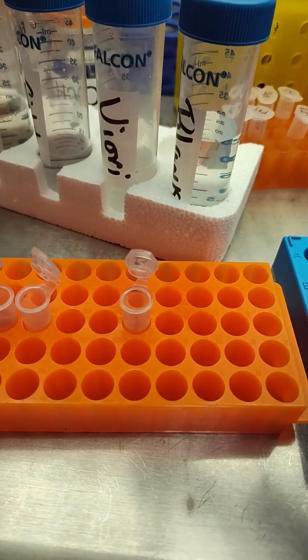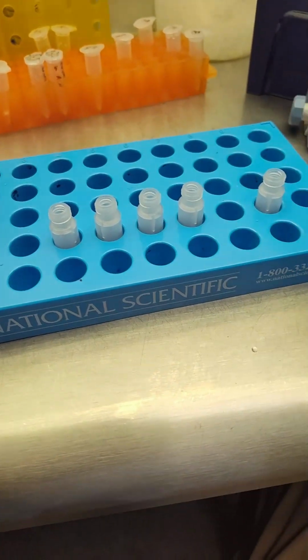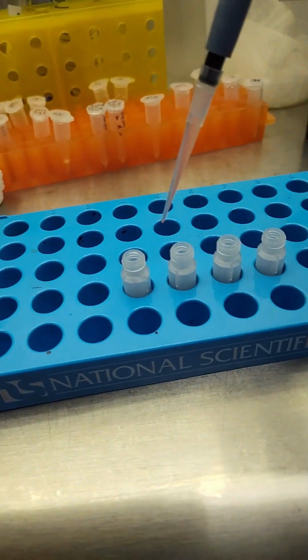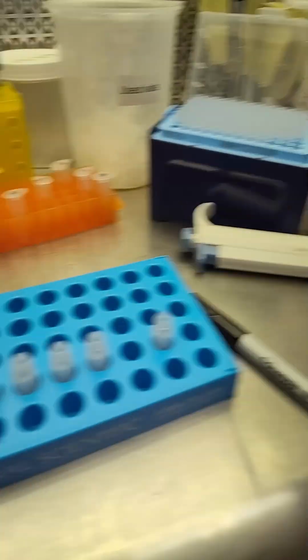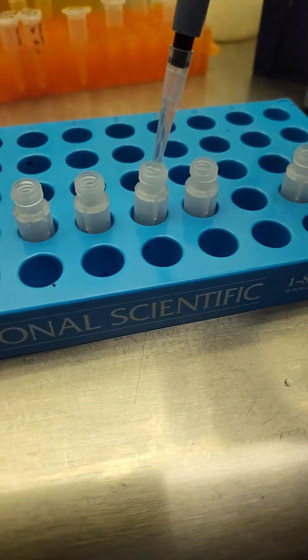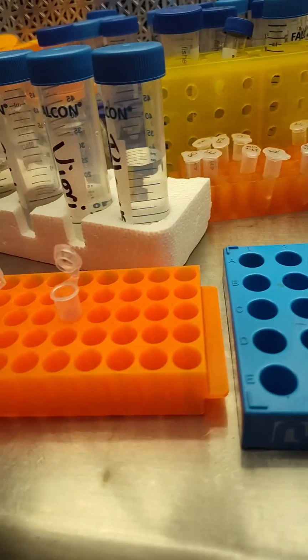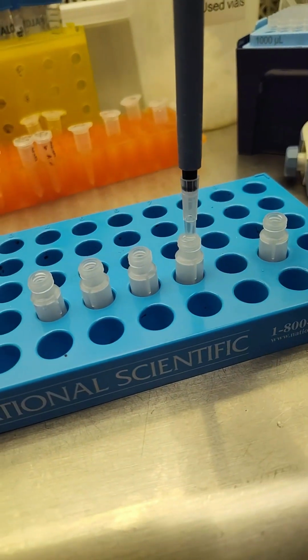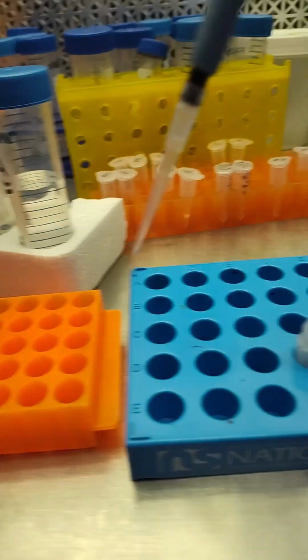And we're gonna go ahead and pull from the top of the tube, so you don't get any fibers or anything like that. We'll go ahead and add these into each tube here. And kind of see like there is a color still on most of the cheap shirts. So that's good. That means we're gonna actually get to analyze it. The Viori's still clear. And our blank is of course clear.